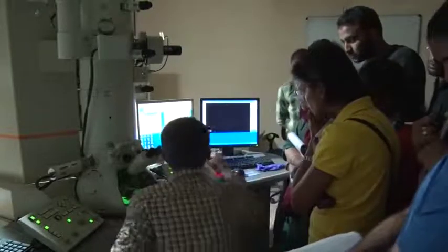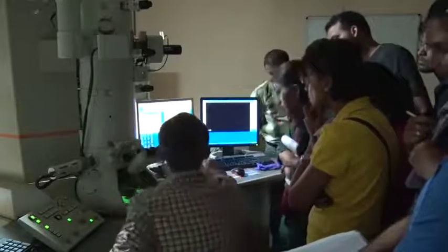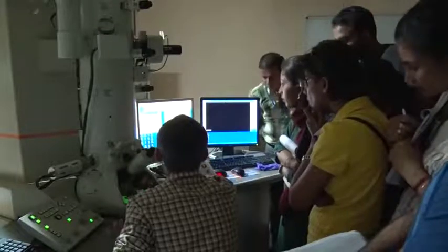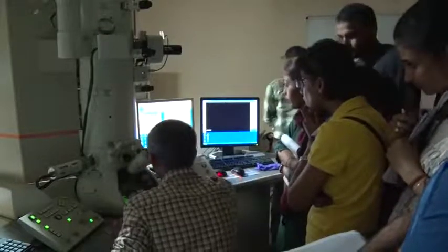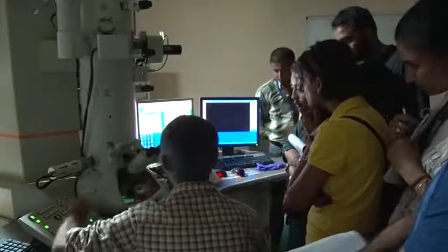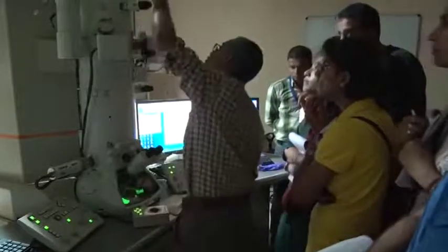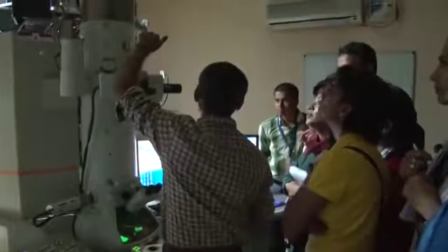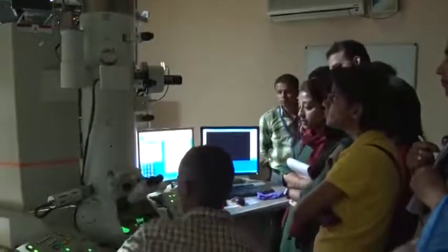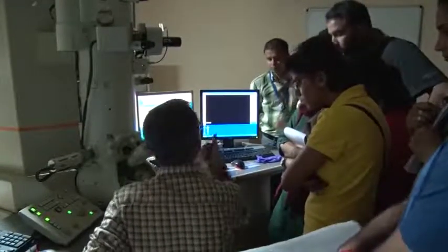So our first step, we said that we will press this button. Our objective lens is standardized, and we are at 10K. We'll go to slightly higher magnification, at least 20K. So 25K should also be fine. And it has become less intense, so I will adjust the current in such a way that it is like now. And just check also which aperture is there. Right now it is the highest or the biggest aperture. So this was the first step.